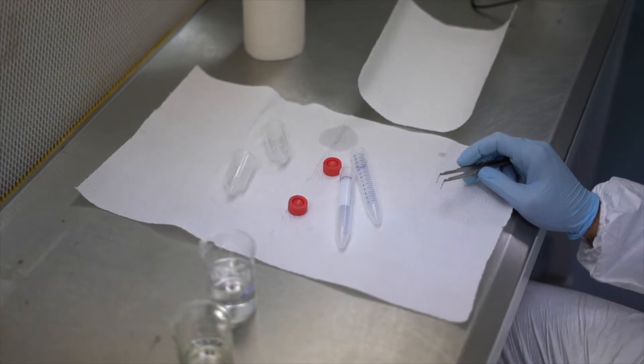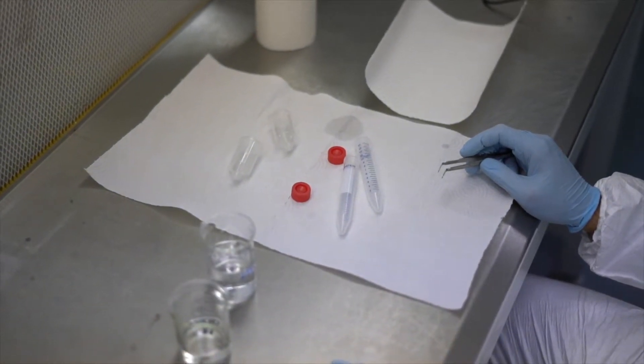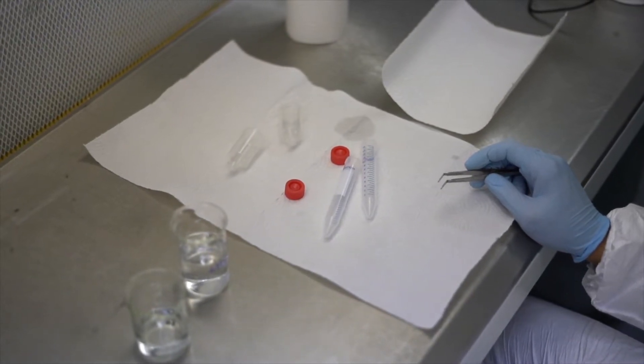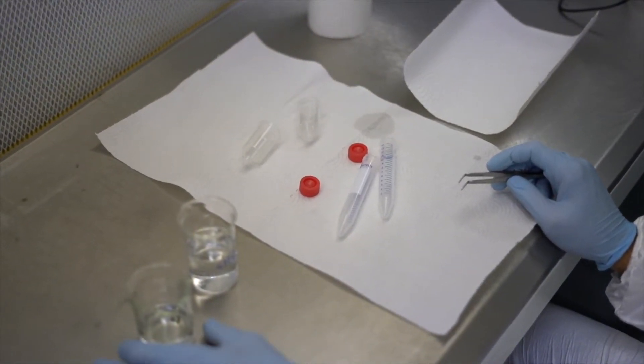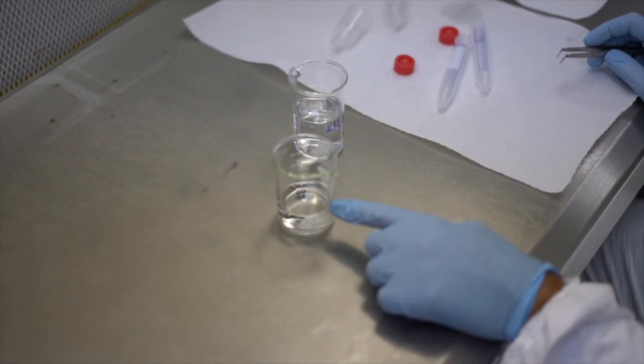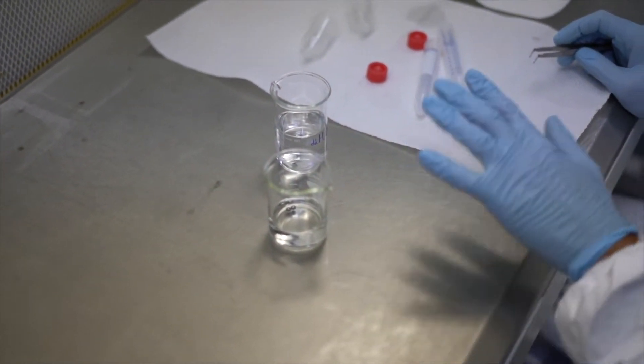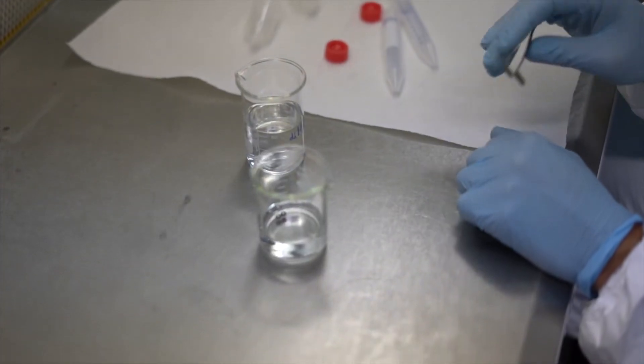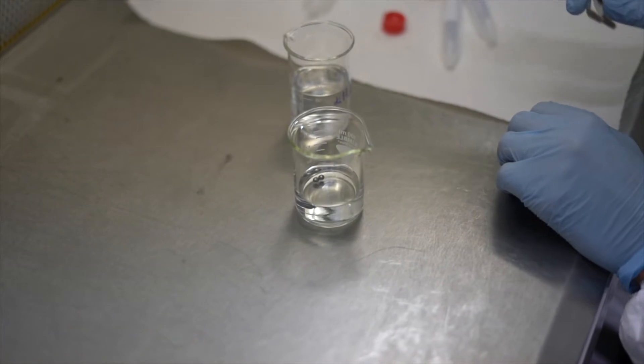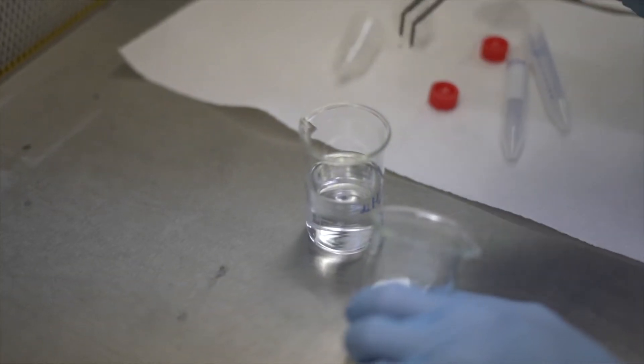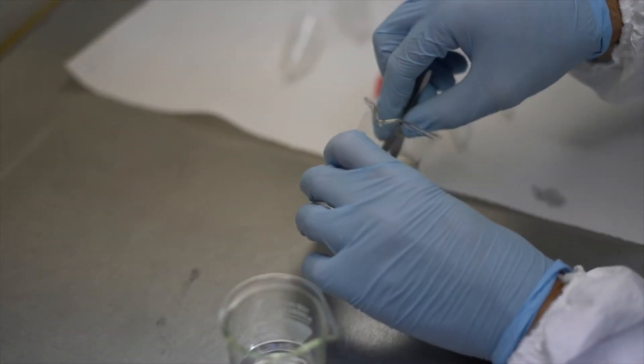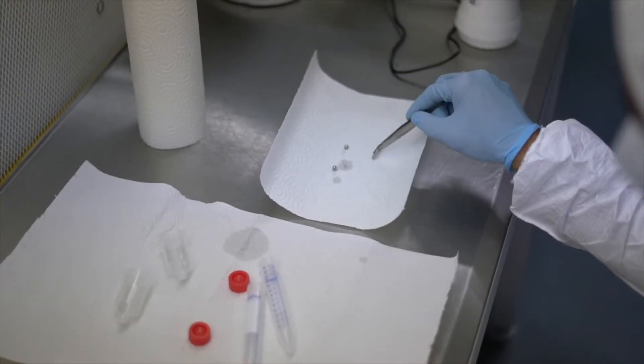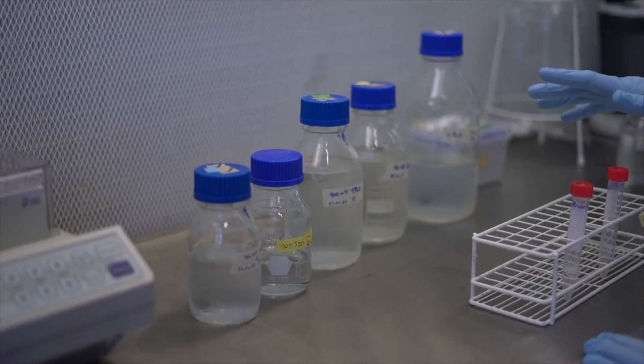Before starting we have to clean all the surfaces with bleach or irradiating with UV light. The same is true for some of the consumables like the beads, the metal beads we are going to use for grinding the plant material, as well as some other plastic consumables. We do that by a bleach bath, 20 minutes in bleach and then rinse it in distilled water. We can shortly dry them and then place them in the tubes with the samples.